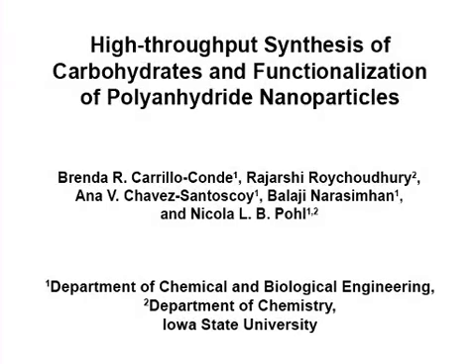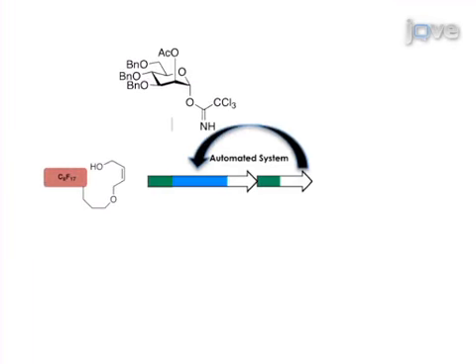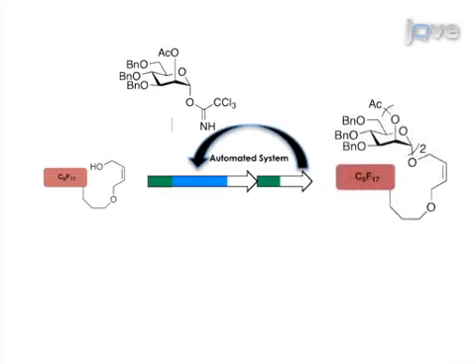In this video article, we describe a novel high-throughput protocol for the automated solution phase synthesis of oligosaccharides and the functionalization of polyanhydride nanoparticles with these carbohydrate-based targeting agents. First, carbohydrate molecules are synthesized using an automated system that utilizes solution phase synthesis instead of solid phase synthesizers.